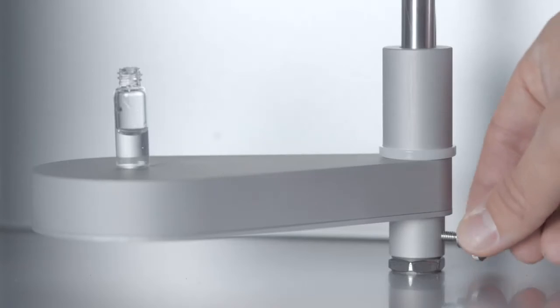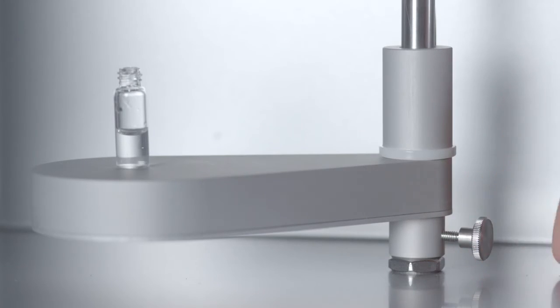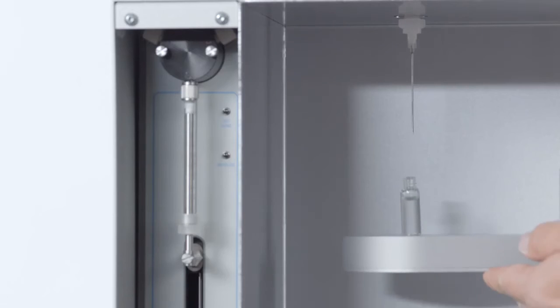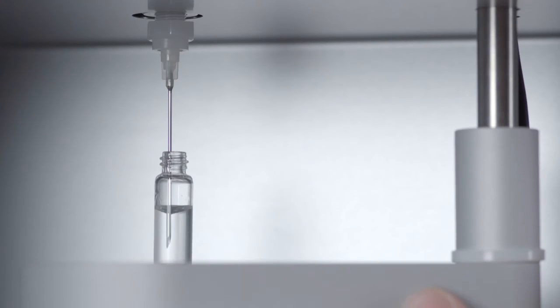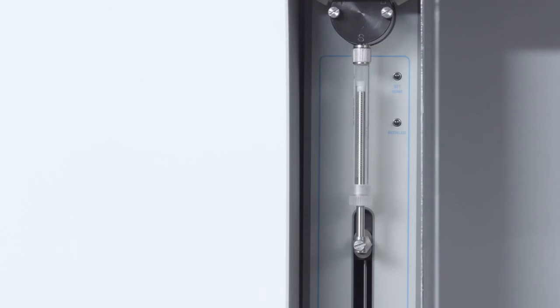These features eradicate the need for constant refilling of the sample and, more importantly, reduce the possibility of cross-contamination.